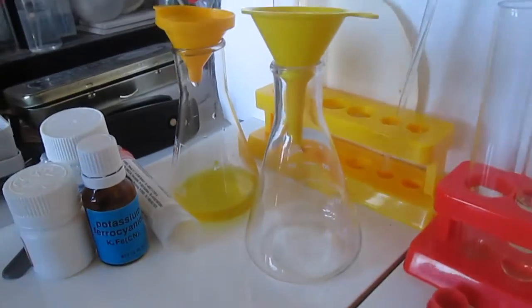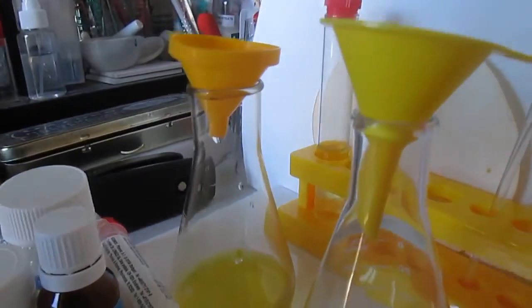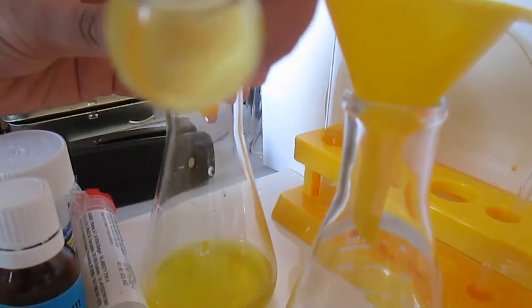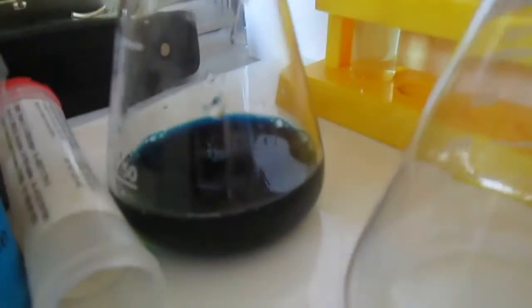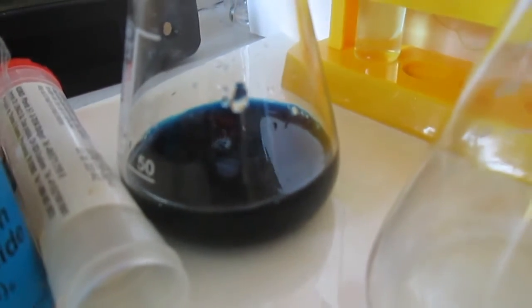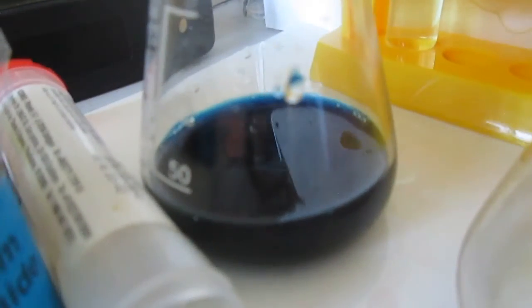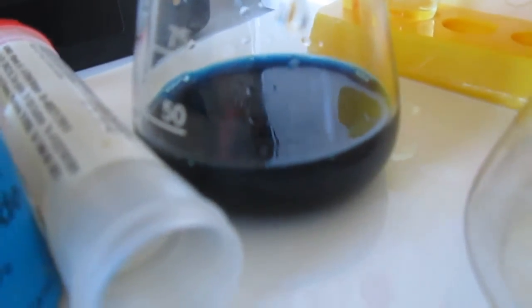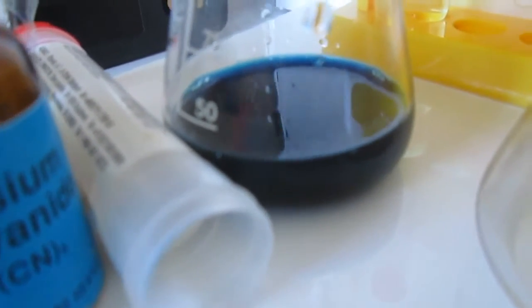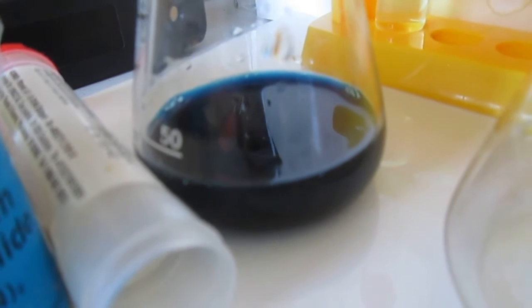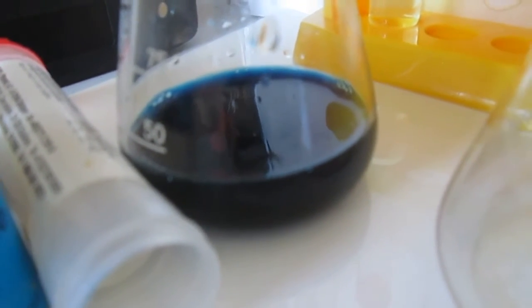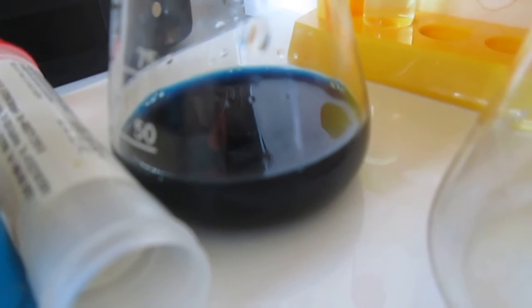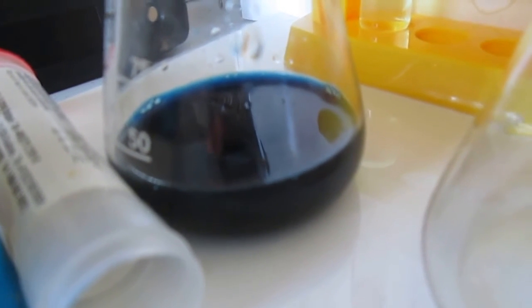We then pour the potassium ferrocyanide into the yellow solution. The potassium ferrocyanide reacts with the iron ions to produce a very dark blue solution. Potassium ferrocyanide is used in chemistry as an indicator to detect dissolved ions in solution.